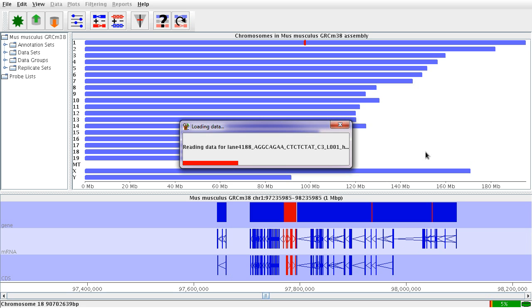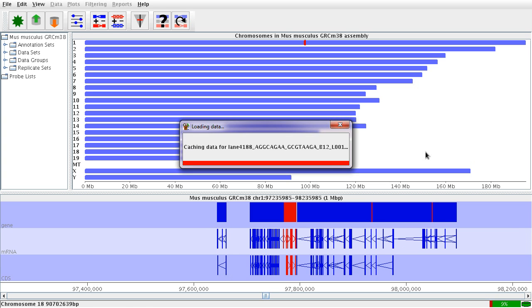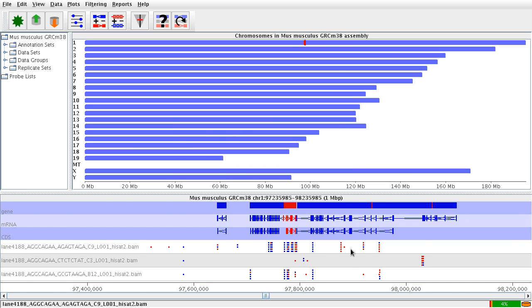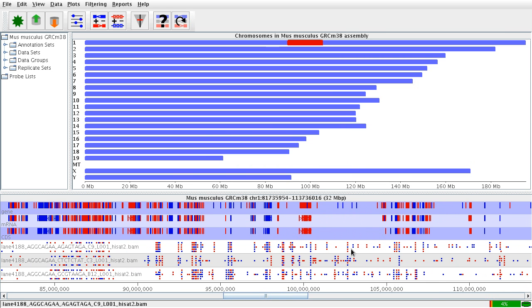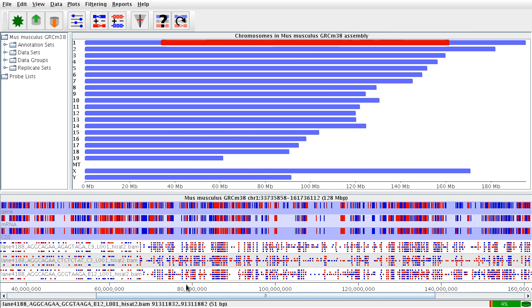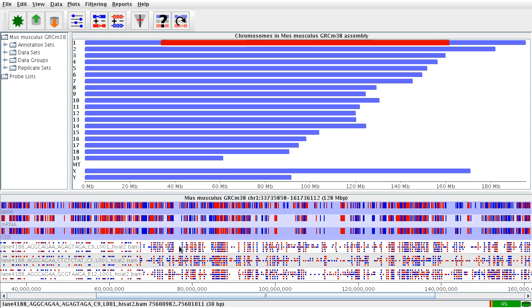you'll see that the data files have all been imported. You'll see that they'll have been set to be visible in the main view, and you should then be able to open those up, see the files, and now start working with this the same as you would with any other SeqMonk project. So hopefully this is something you'll find useful to get your project started more quickly.